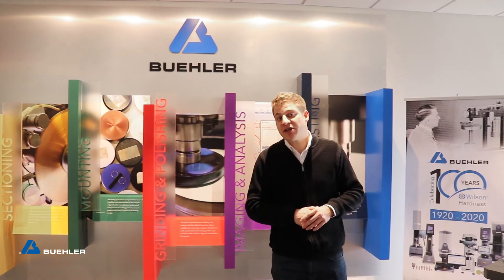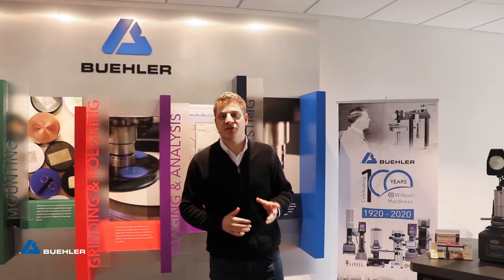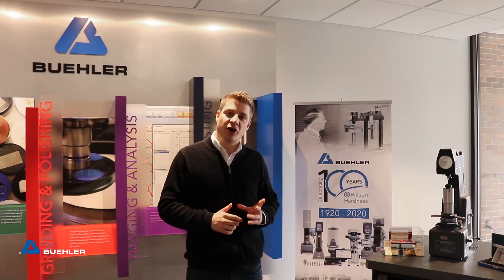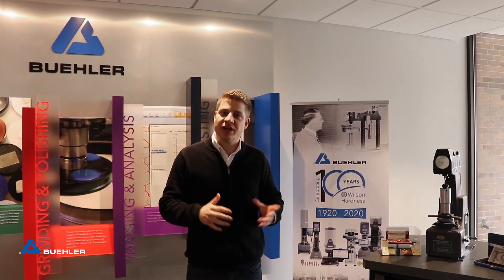This year is a special year for us because we celebrate 100 years of Wilson Hardness. Today I will show you our latest equipment, our own hardness testing software, and what we can do with it.